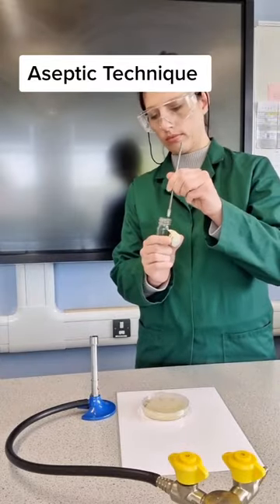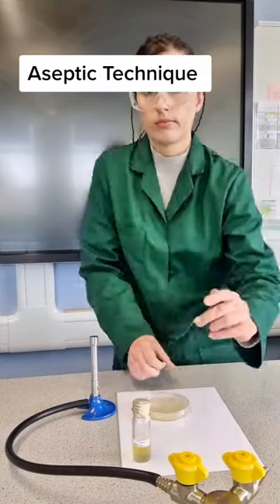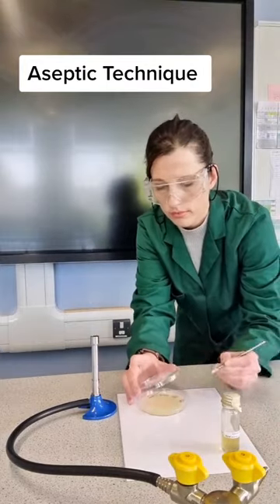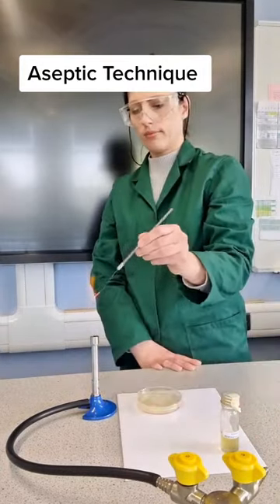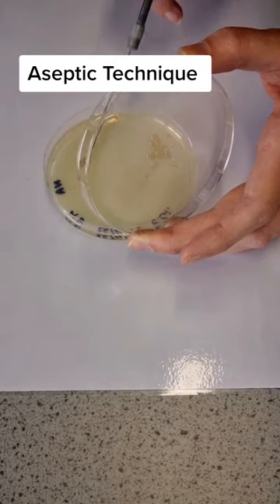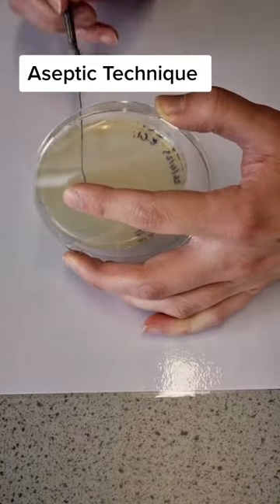Then you need to let it cool down before going into the bacterium. At that point I'm going to streak my bacterium over the agar plate, making sure that I'm working with the Bunsen burner so the air around is sterile and not lifting up the lid too much. Once I've completed my streak plate, I'm then going to use two bits of tape.